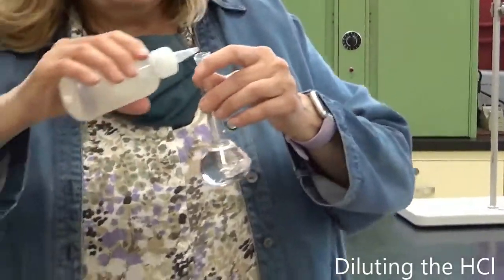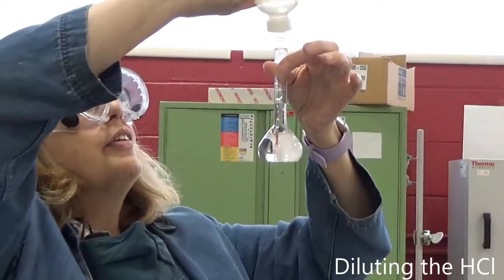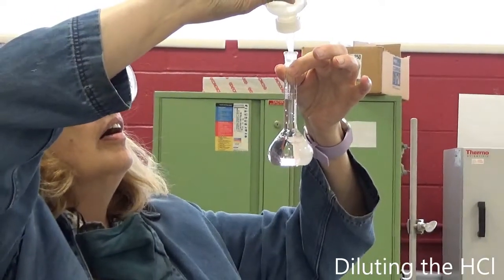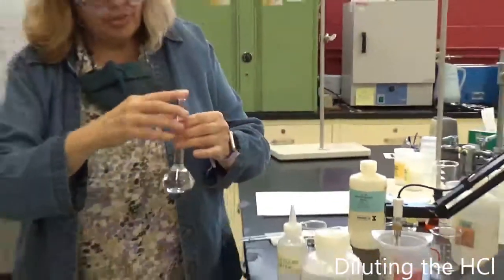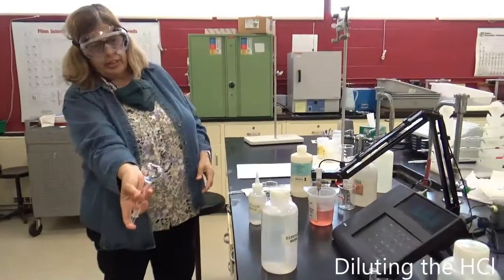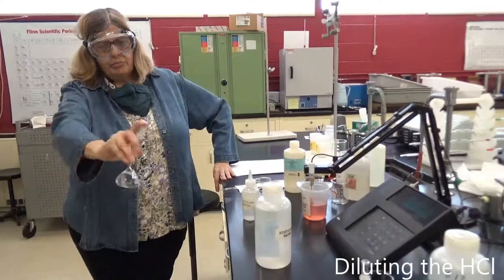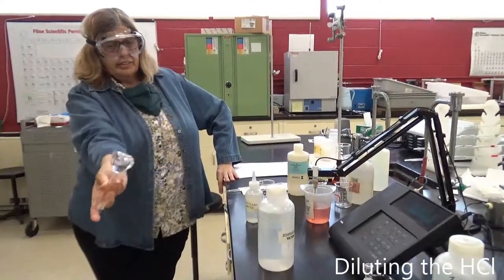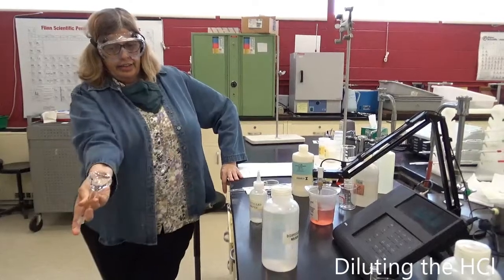Now I will try to fill it to the mark, which is pretty high on the neck on this one. Okay, good. And now, like you always do, you invert it 10 times. Let the bubbles go through, and that's how you make sure you mix it. 5, 6, 7, 8, 9, 10.